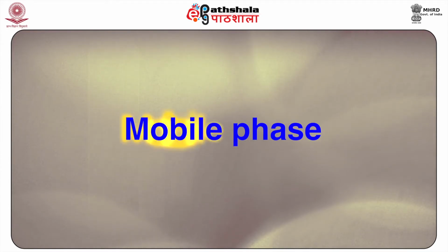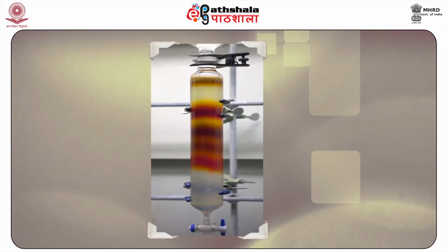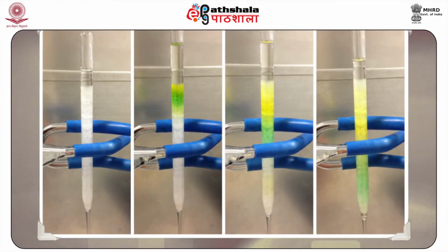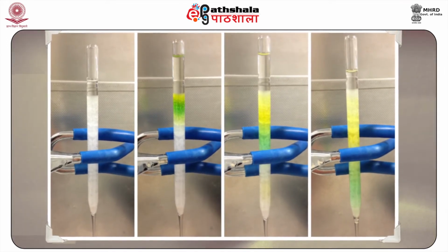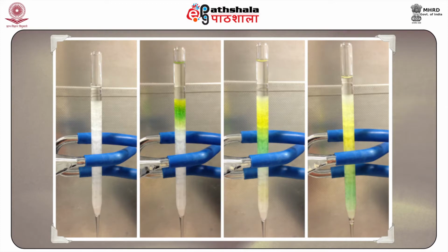Now, the mobile phase. A single solvent or a mixture of solvents could be used as mobile phases. The nature of the compound under analysis affects the choice of the mobile phase. A correct choice of mobile phase can give accurate results with a higher degree of resolution. All sample components show differential affinity towards their stationary phase and thus elute out of the column at different times along with the moving mobile phase.